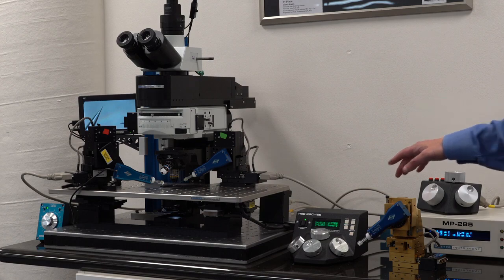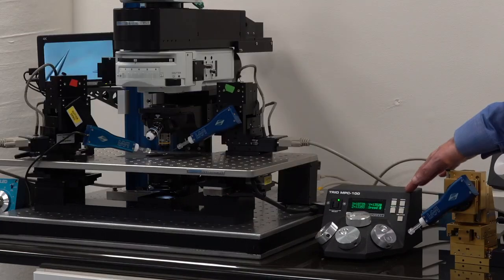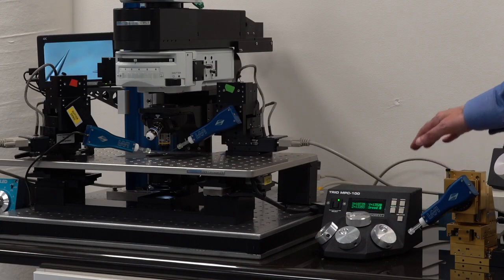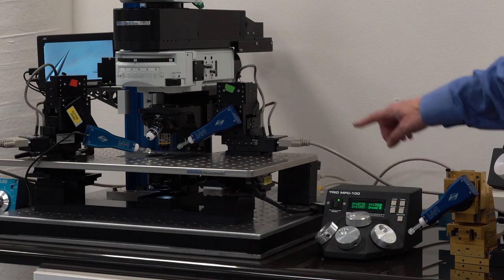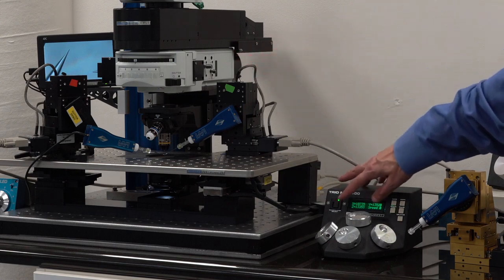The MPC-100 is also a dual controller just like the MPC-200. So I can connect it to two different manipulators. In this case, two trios. I could have connected it to my old traditional manipulators as well, but it was made for the trio.